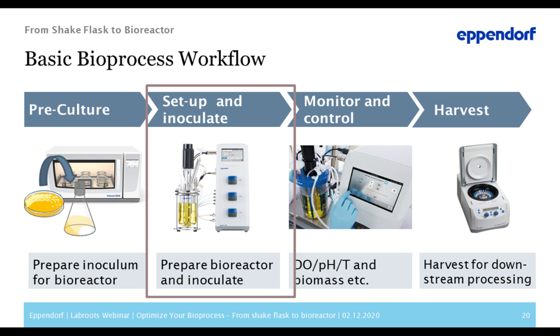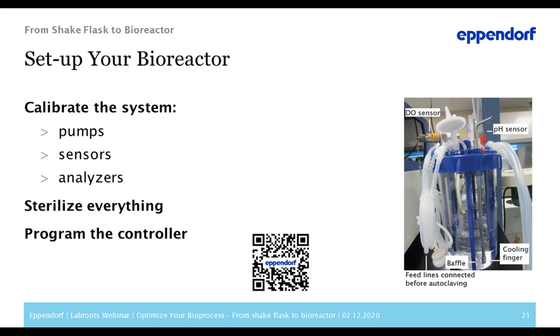Thank you, Ines. And as I just see, there's also a huge part of you who didn't start working with bioreactors yet, so maybe I can convince you that you should consider going the next step. And if you're afraid to do so, maybe you're not afraid anymore after this webinar. As you did see, there were already a lot of aspects to consider for the first step of the bioprocess workflow. And I will now walk you through the next steps, starting with the setup and the inoculation of the bioreactor, and then talking a little bit more about monitoring and control possibilities.